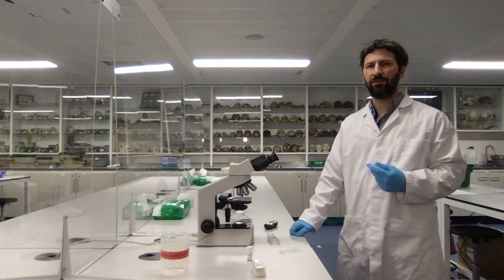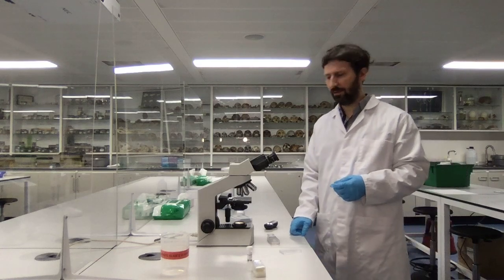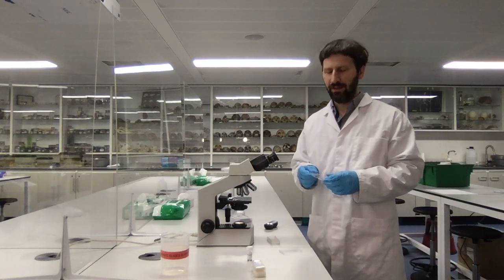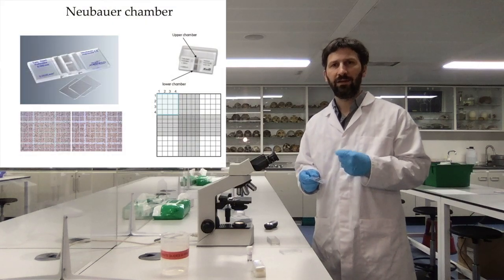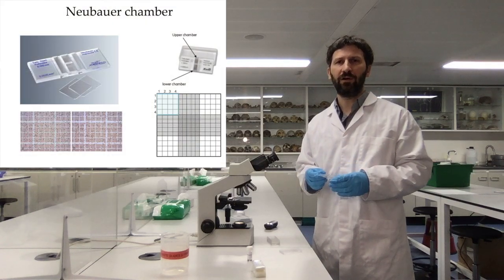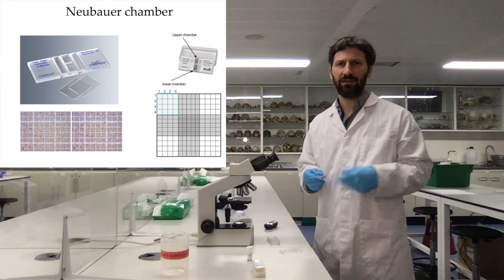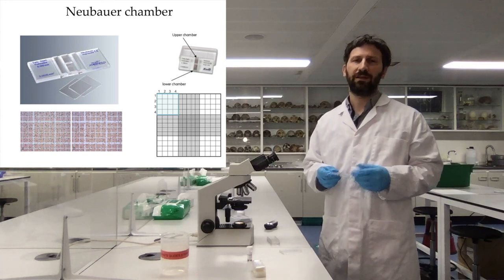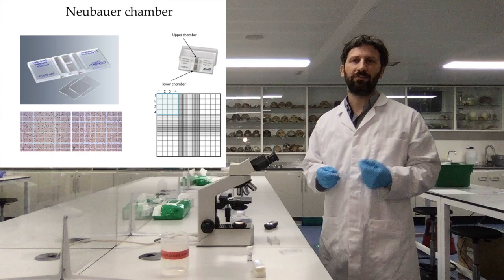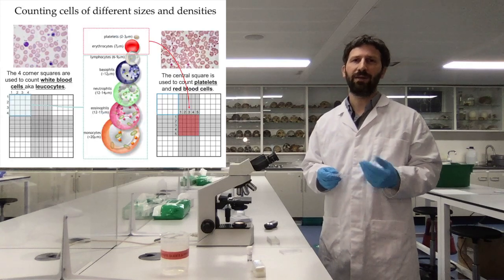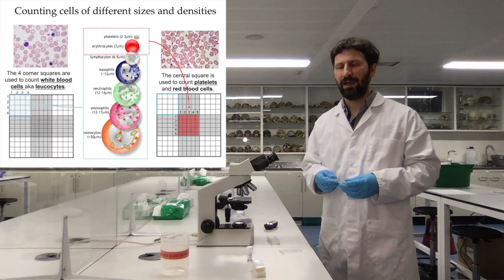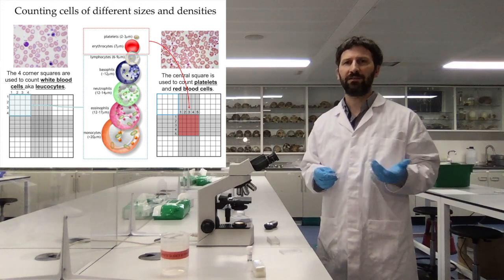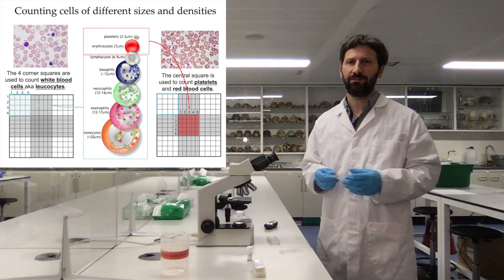In this practical, we learn to use the hemocytometer, which is this modified microscope slide that has a small grid containing a known volume of suspension and can be used for counting cells. It happens quite often in a lab that we need to count cells — it could be blood cells, for instance, and the name hemocytometer actually refers to blood cells because hemo means blood.